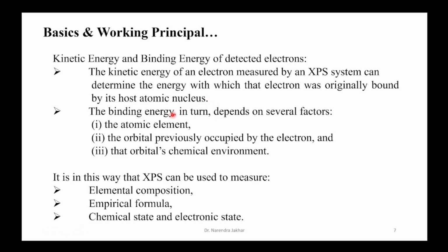The binding energy in turn depends on several factors: the atomic element present on the sample surface, the orbital previously occupied by the electron, and the orbital's chemical environment.